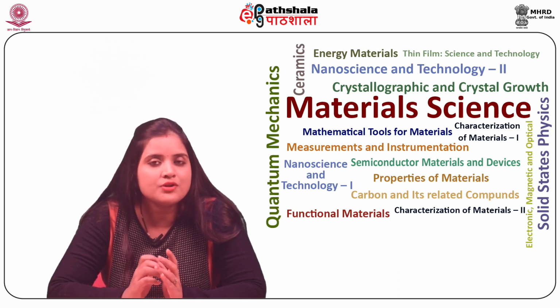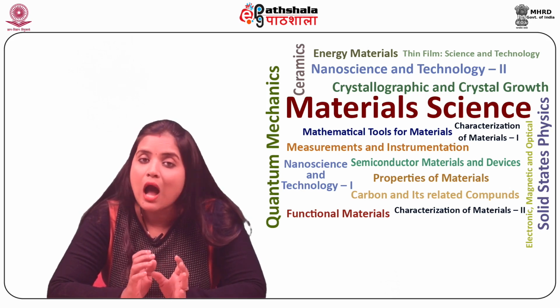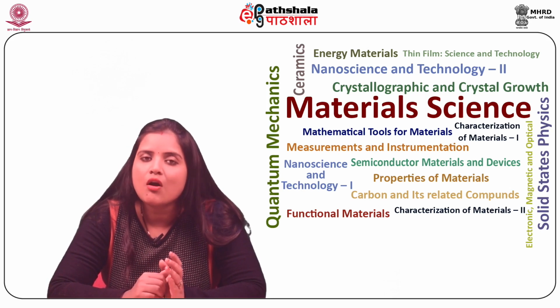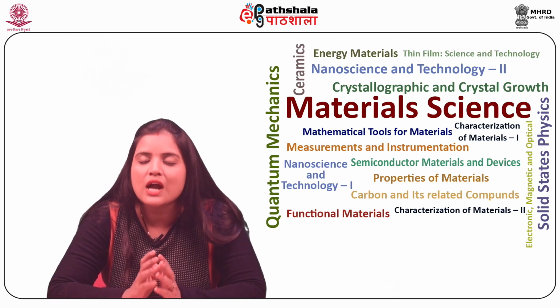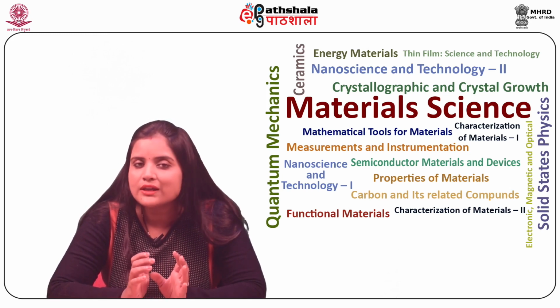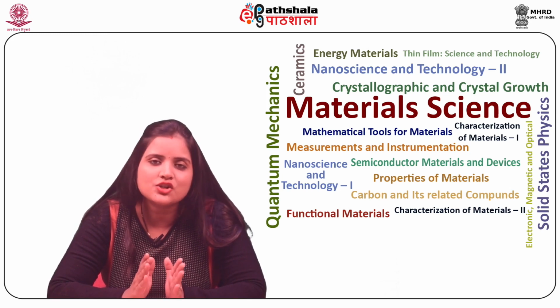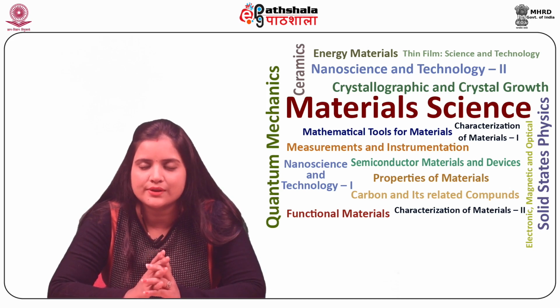SPM belongs to the branch of microscopy which produces high definition images of a surface using physical probes that scan the sample. This is done by keeping the probe stationary and moving the sample, or vice versa.